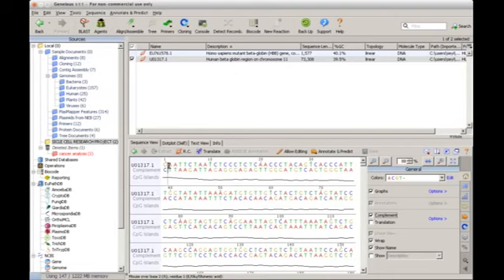So this is a single strand, but this is the double strand of this nucleotide sequence. But majorly what you downloaded is the single strand, but you can actually deduce this double strand using the Geneious application.